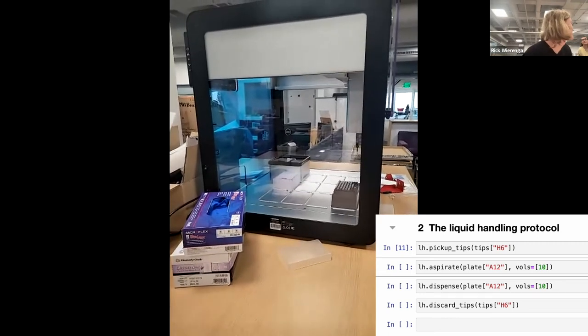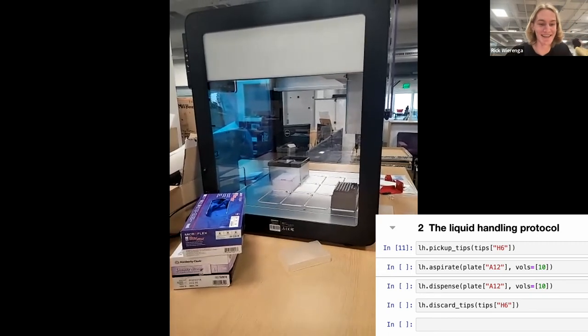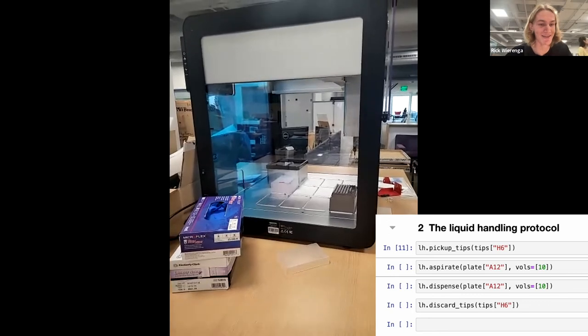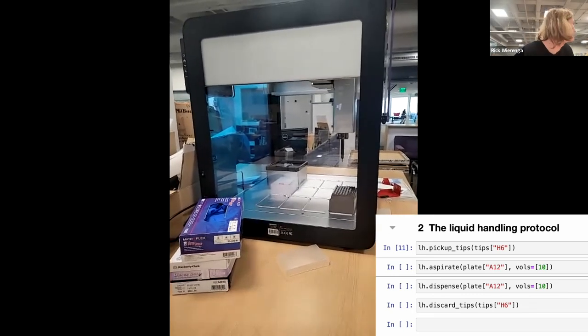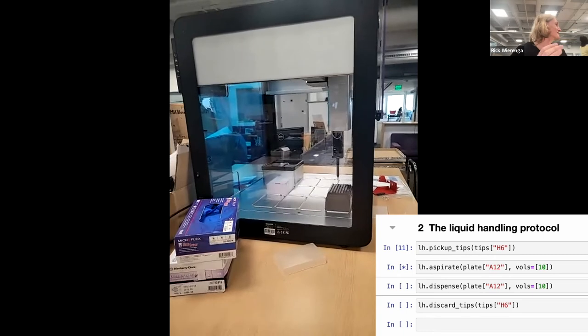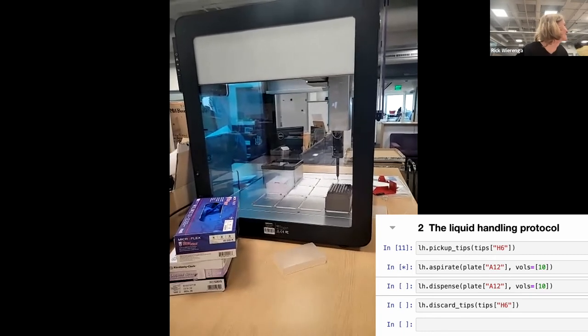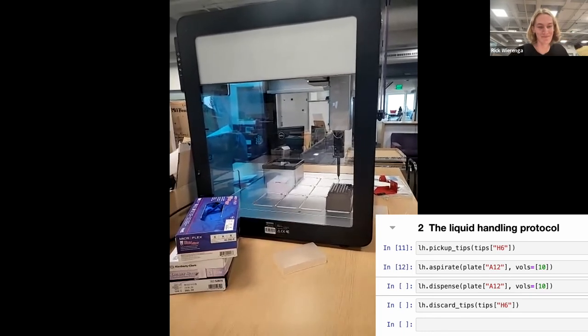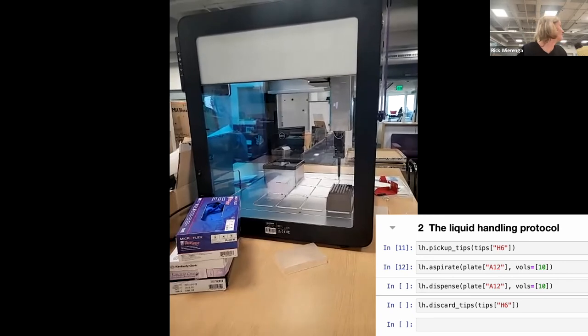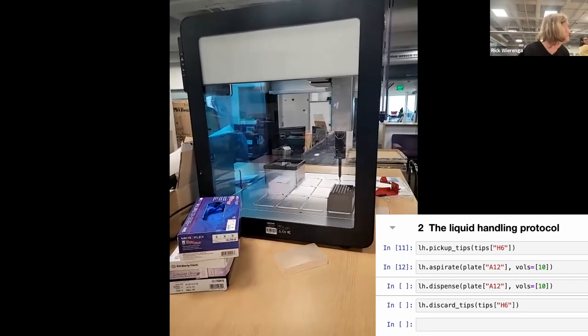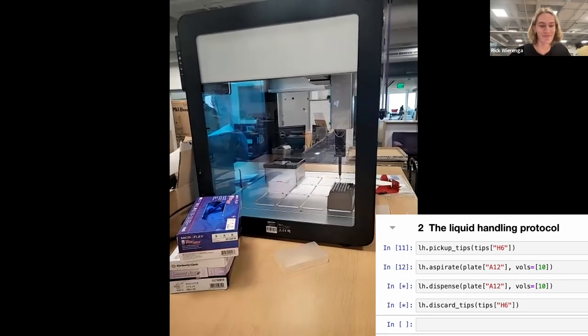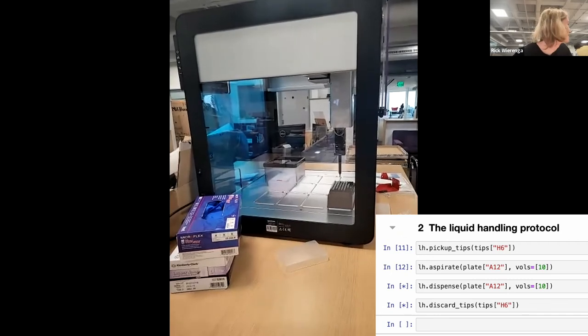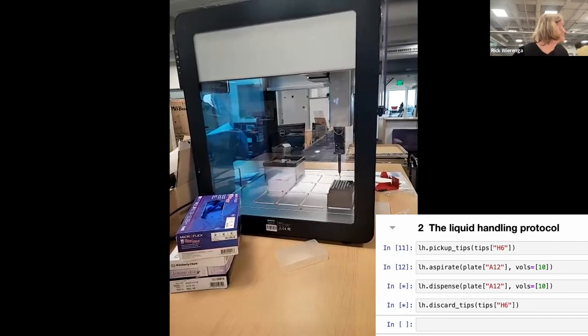I think we're done. Picked up a tip as y'all can see. And then we aspirate from the plate. Just aspirating air here, but you can imagine this is liquid. And then we put the air back. And then when we are done, we also put the tip back.